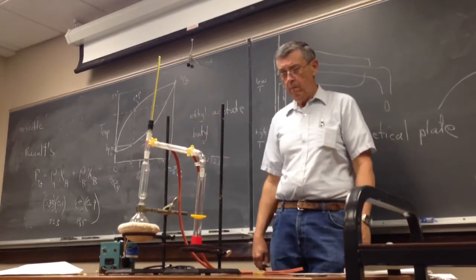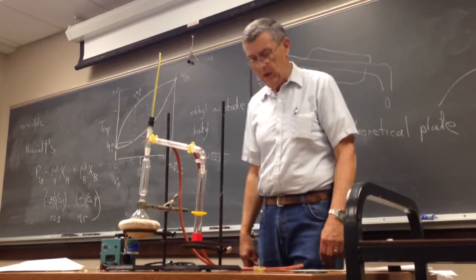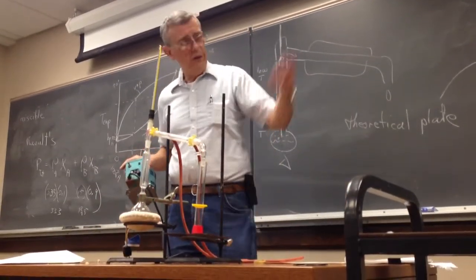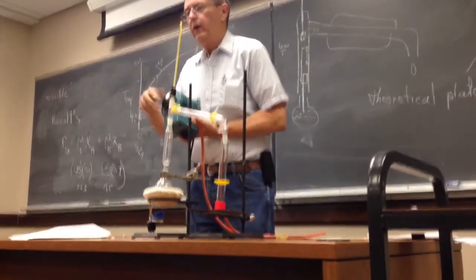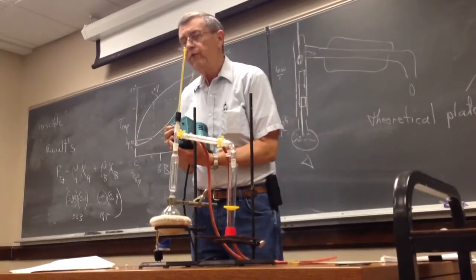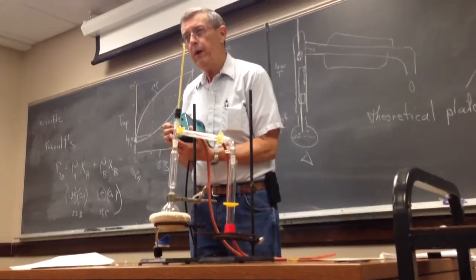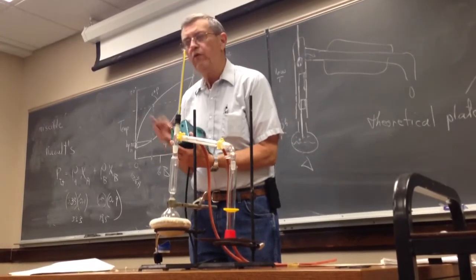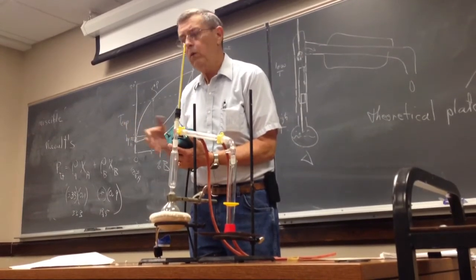That's all good. I need a heat source. Well, I've got the heating mantle over here. Power stat, just like a rheostat on a light. Power stat is what we use. There's the knobby part of the thing. It has an on-off switch. Actually, this one has two different voltages. It's a step-up transformer. It's 120 or 140. I'll pick 140 eventually, but it should be off until I'm ready to go.